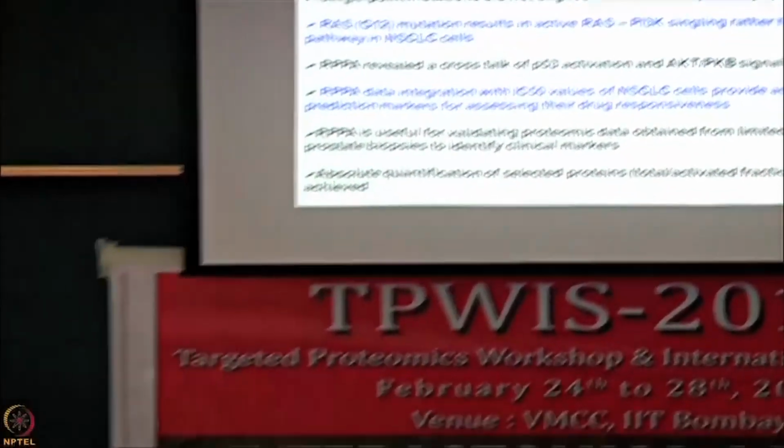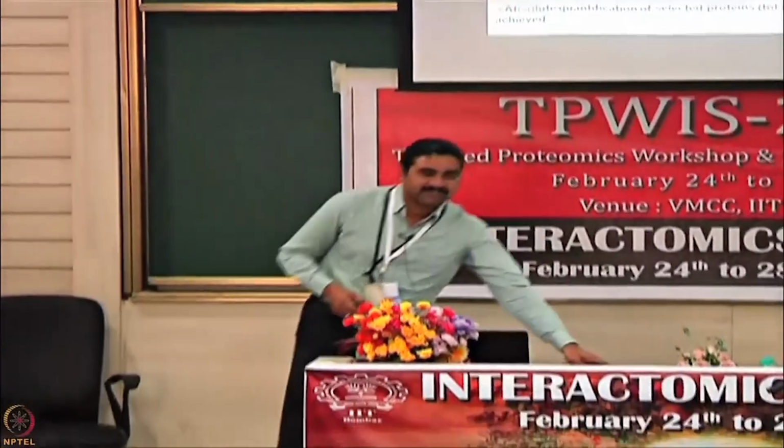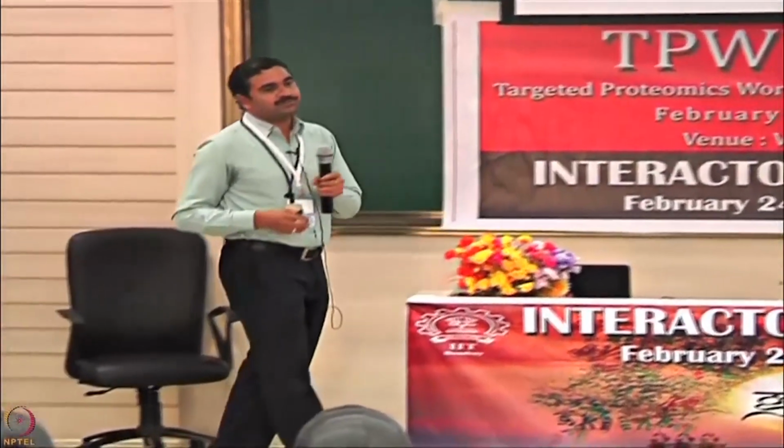But all in all, now you might have understood that the necessary steps to follow, printing and then hybridization and all, are the same. The only difference between forward arrays and reverse arrays is that here you spot just the crude lysate. You do not have to follow any separation of samples. So, in one experiment on one slide you can estimate the quantity of a particular protein of interest across a large number of samples.